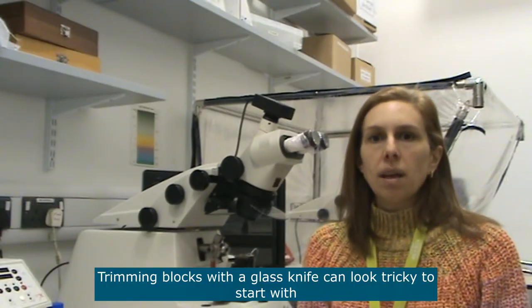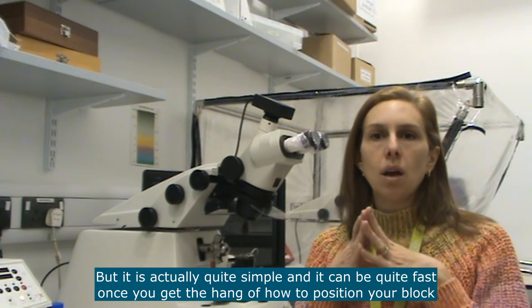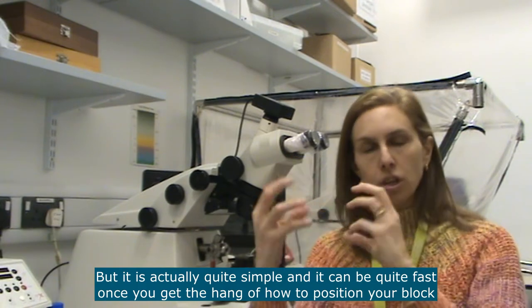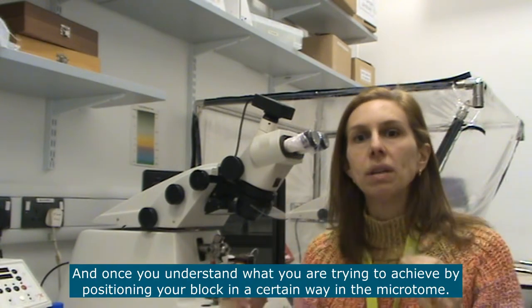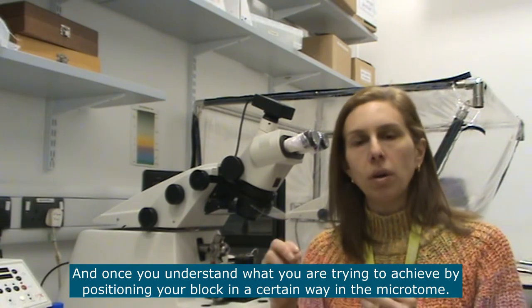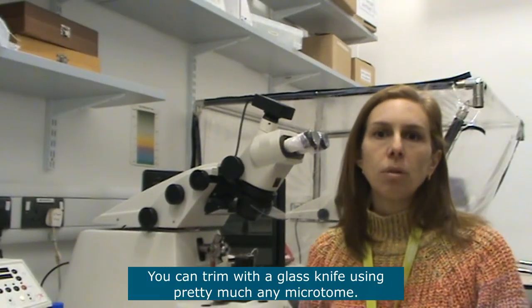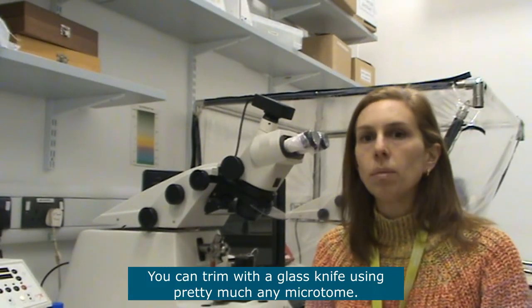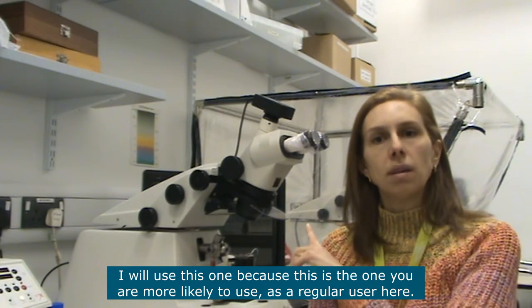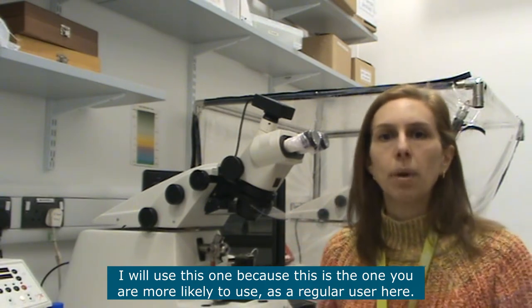Trimming blocks with a glass knife can look a bit tricky to start with, but it's actually quite simple and it can be quite fast once you get the hang of positioning a block and once you understand what you are trying to achieve. You can trim with a glass knife using pretty much any microtome. I'm going to use this one because this is the microtome that as a regular user you are more likely to use here in the center for bioimaging.